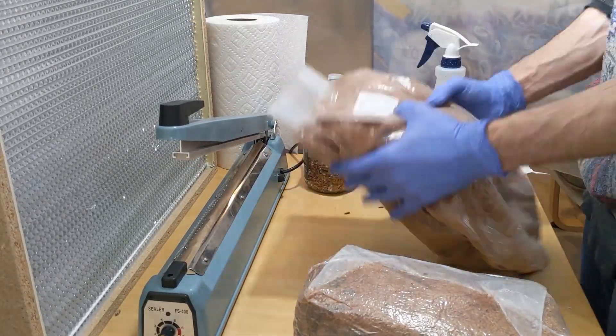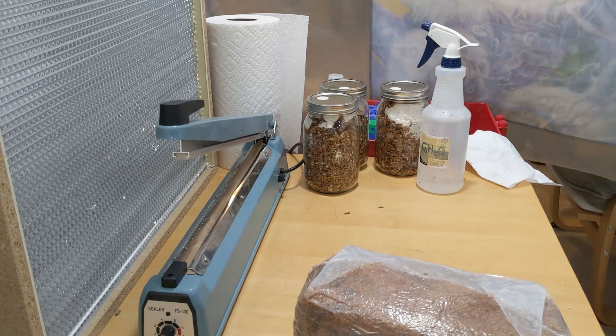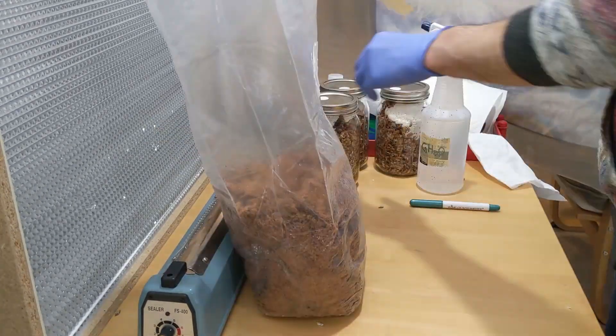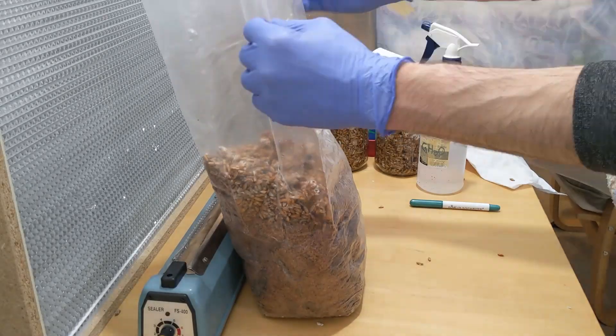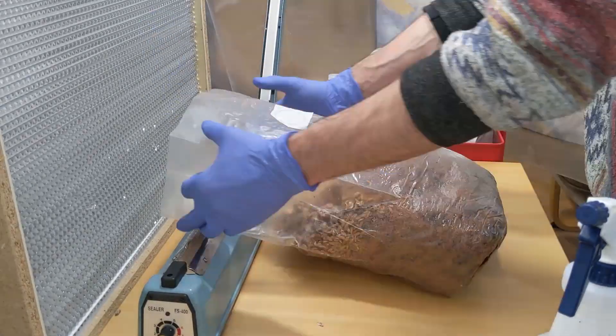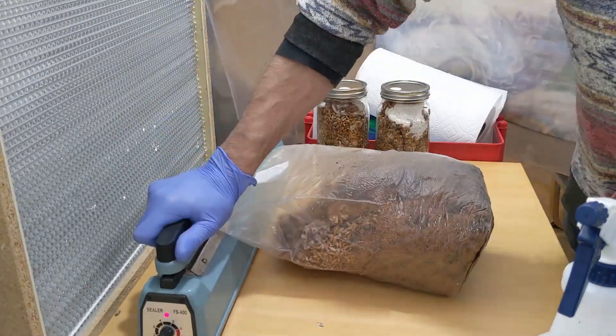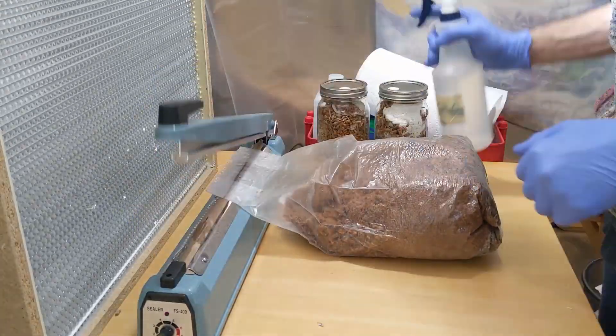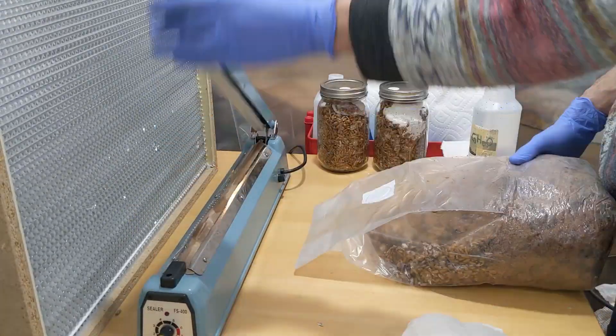With the second bag, once I'm done dumping the grains in, I kind of let it take in a little bit of air. As you can see, it's a little bit bloated, and now the shaking part is much easier and everything is going to get dispersed and we can ensure an even colonization.